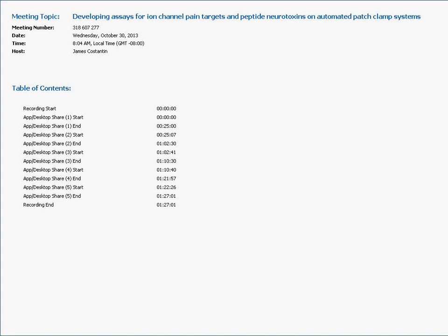And I was able to come up with another good IC50, and this one came out using the Langmuir isotherm Hill equation, and came up with the IC50 of 1.38 micromolar. And going on with BRMT derivative number 3, this inhibited it pretty well as well. And we see the inhibition here with the apparent IC50 of 1.3 micromolar.